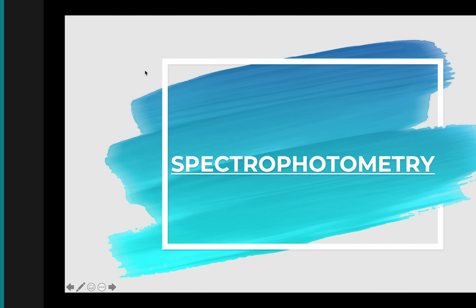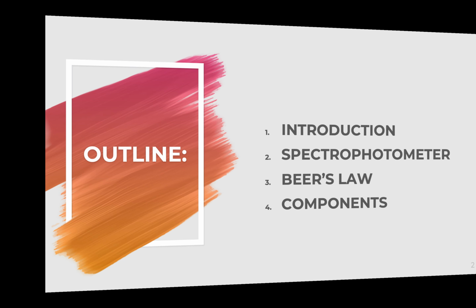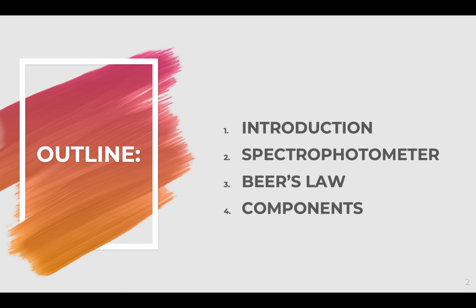But for today, what we will be discussing is all about your spectrophotometry. Yes, your spectrophotometry. This is the first instrumentation, first analytical technique that we will be discussing for today. So let's dig in. All right. So our discussion for this morning will all be about the introduction to your spectrophotometry.